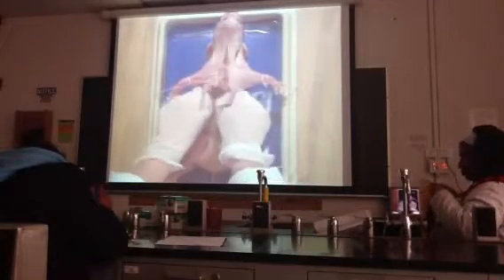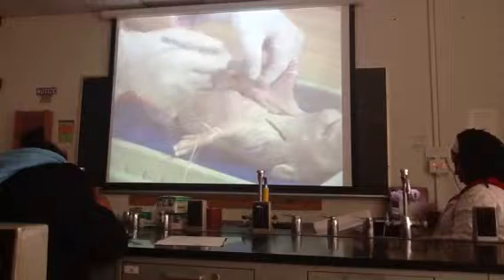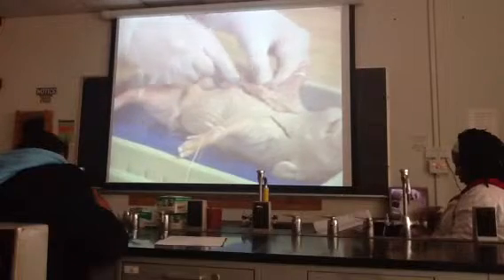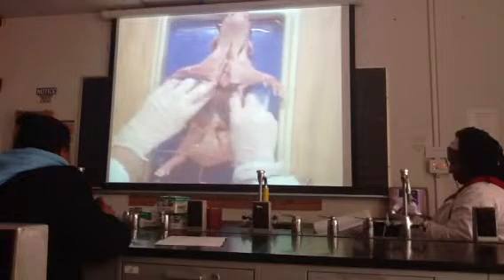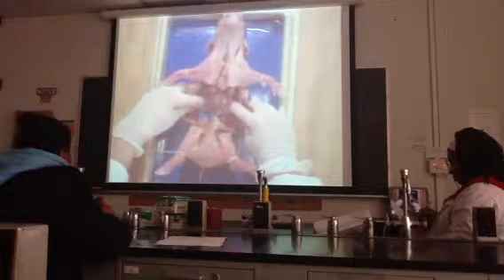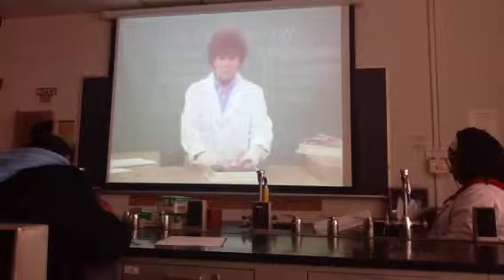Once you've made these lateral cuts, you're able to fold back these flaps of tissue. And as you do so, you're going to have to cut through this partition between the thoracic and abdominal cavity. This partition is made of muscle and is known as a diaphragm. Cut through the diaphragm then. Fold back both flaps of tissue. And note that you're going to have quite a bit of preservative in here and maybe some brown fluid. At this time, you want to take your specimen to the sink and flush out this fluid, and then you are ready to observe the internal anatomy.